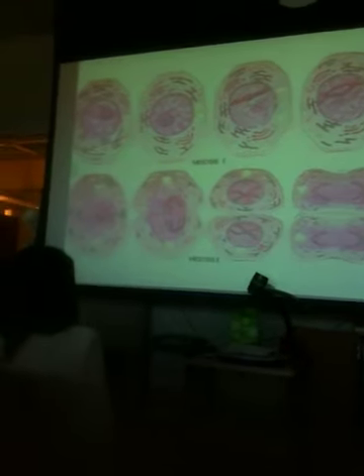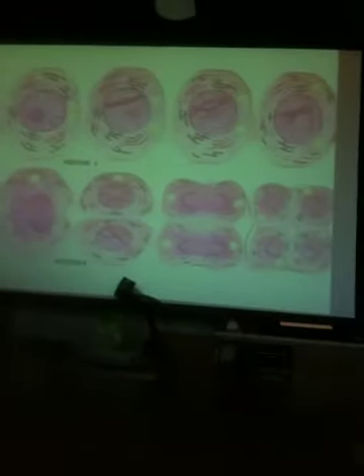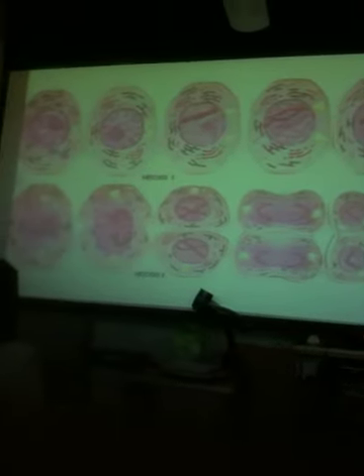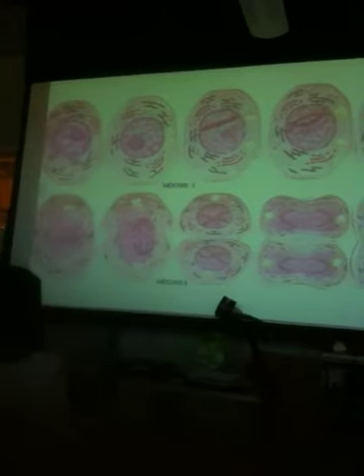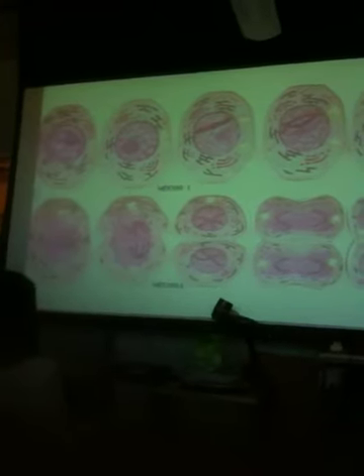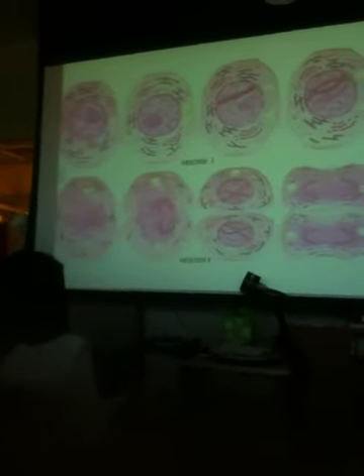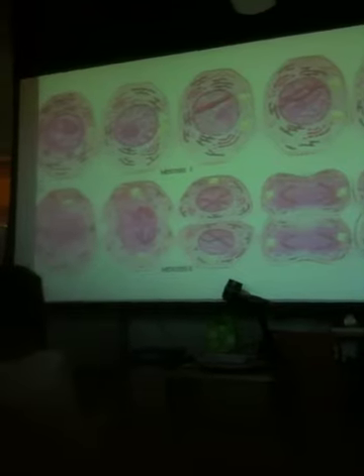Actually, this is the beginning of meiosis 2. These are the cells that are undergoing meiosis 2 right there.